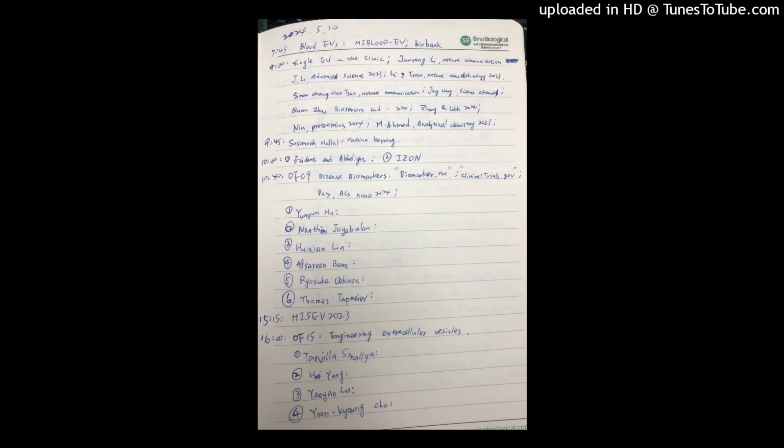Thanks, Rick. We've done this recently where, as much as reporting standards and inclusion criteria are really important, we've also looked at exclusion criteria, right? So things like hemolysis is one, but maybe fat content is another, platelet activation is another. And our primary readout is proteome depth as well as coverage, right? So as soon as we see any confounding variable from a sample, we have a significant impact in the depth of our proteome, so how many proteins we're seeing, as well as the coverage, this dynamic range, okay?